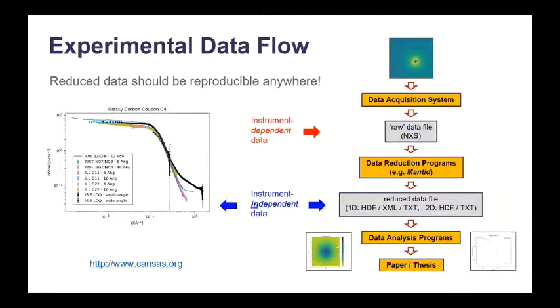masking of pixels, accounting for the sample transmission, the beam size, and the sample background, things like that all get corrected for. The data coming into data reduction is variously called live, or raw, or unprocessed, and probably a few other things besides. At the SNS and ISIS, this raw data is stored in the form of Nexus files, and we'll learn a bit more about those later.